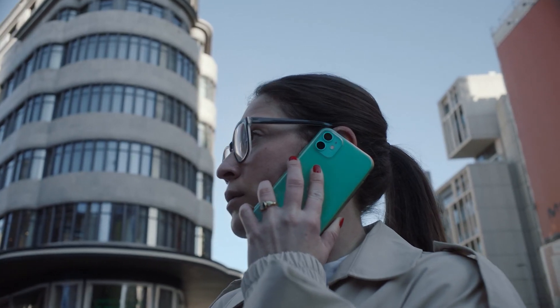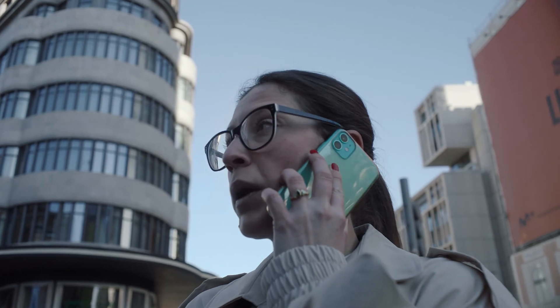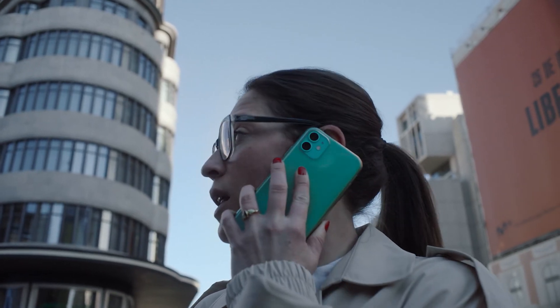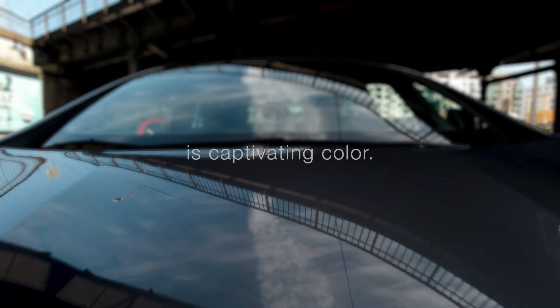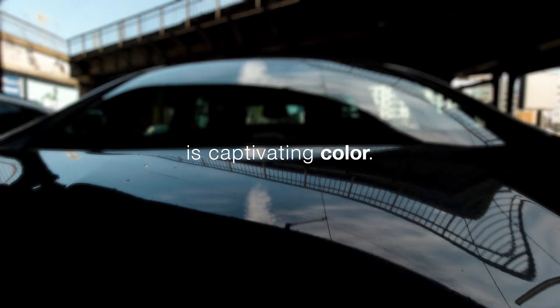With so much riding on color, it's imperative to get it right because consistent color is captivating color.